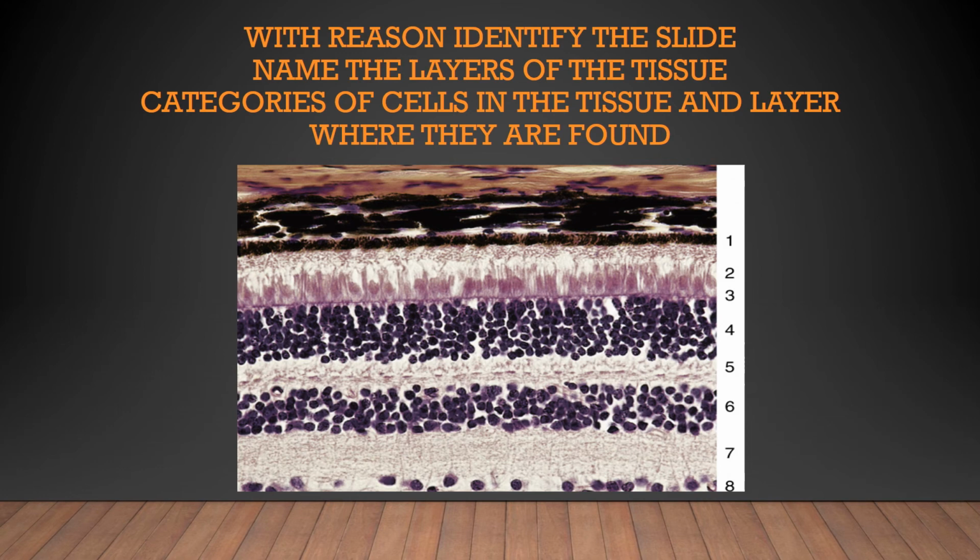So you have the horizontal cells, which establish contact between the different photoreceptors, and amacrine cells, which establish contact between the ganglionic neurons. You also have Müller cells, which extend from the external limiting membrane to the internal limiting membrane, and they basically support the other cells.